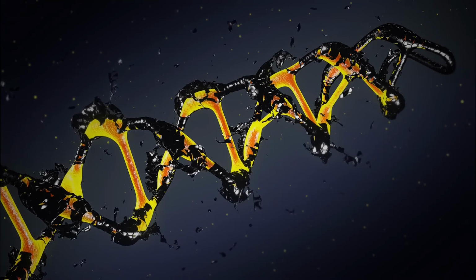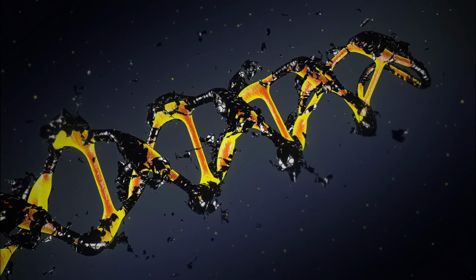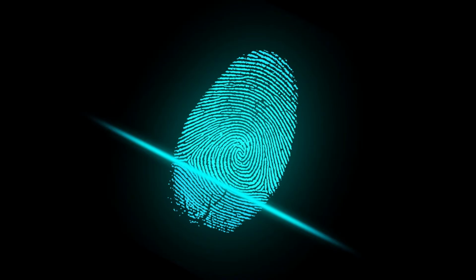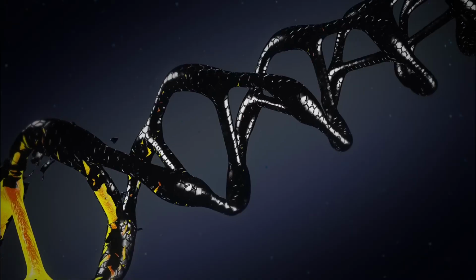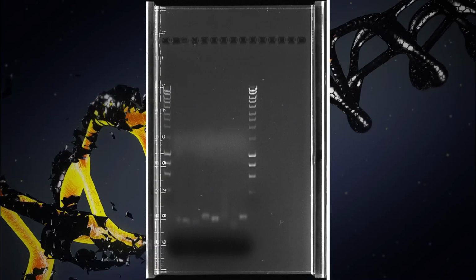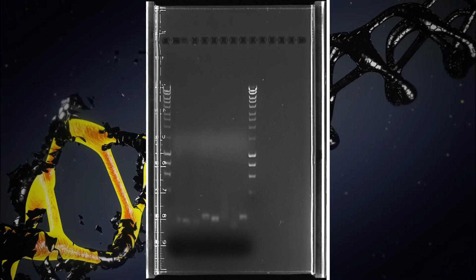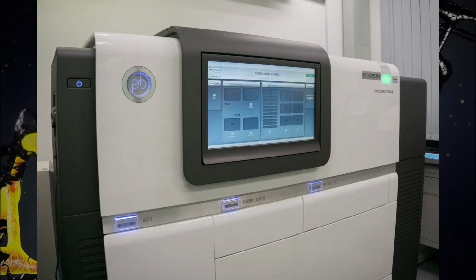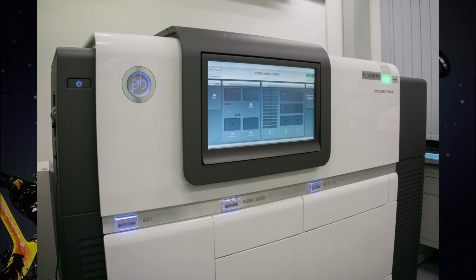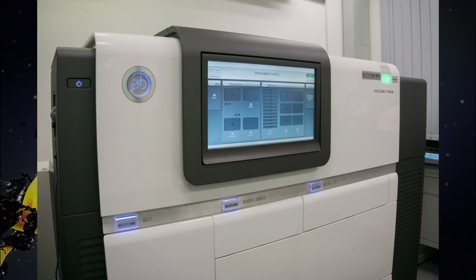Finally, we wish to talk about something known as arbitrarily primed PCR. This is a sort of fingerprinting technology. That is, it allows you to use a small short primer, which generates varying lengths of products from the whole genome sequence. Once this is done in PCR, and you get your initial results, the products are then separated via gel electrophoresis. This technology can be useful if you're trying to figure out whether or not, for example, a bacterium is in a related family or the same family as another sample you've taken.